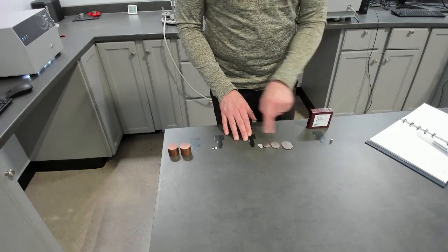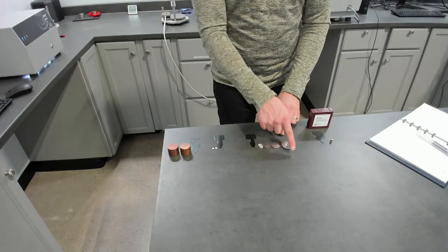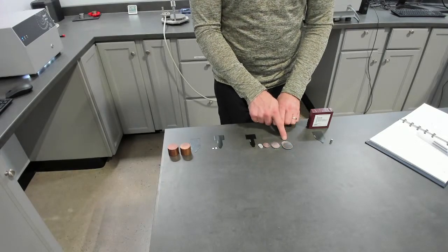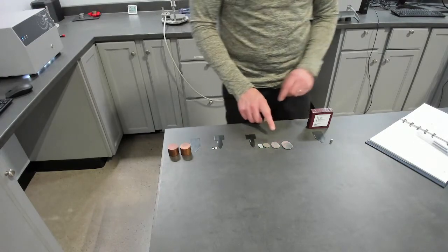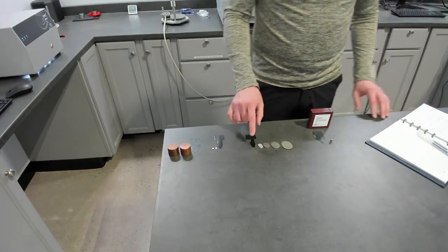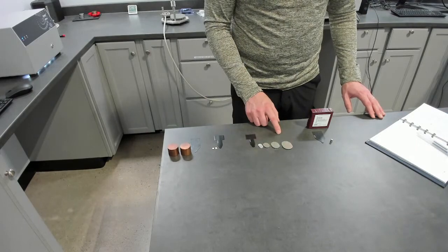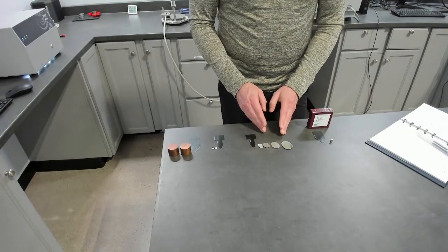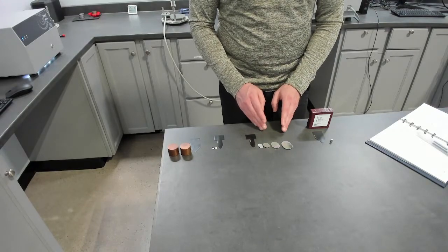So you'll see in this example when we share the data that we essentially did 0.25 second measurements on all of them to stay within the boundaries of the sample, because aluminum has a pretty high diffusivity. But we were able to take our 0.25 second measurement and chop it down further. At 0.25 seconds, we're collecting 600 data points.